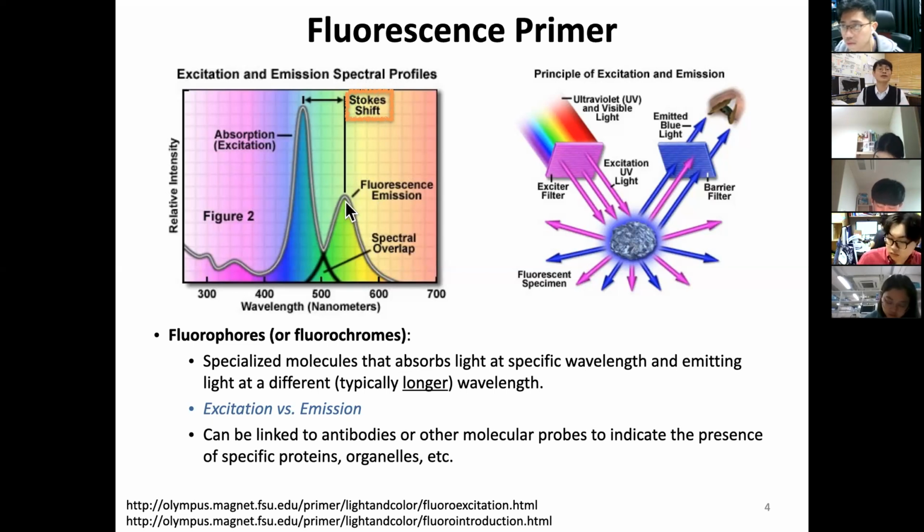You can simply consider, hey, you don't want to go into the sunlight, UV light. UV light has a shorter wavelength. It has a high energy. It's likely to damage the DNA in our skin, cause skin cancer and pigmentation of our skin, which is not good for our aesthetics, right? So that's the concept of excitation photon and emission photon, which have different color or different energy.